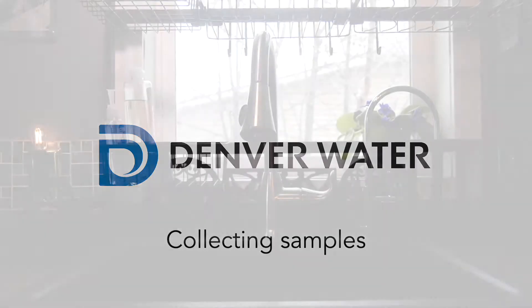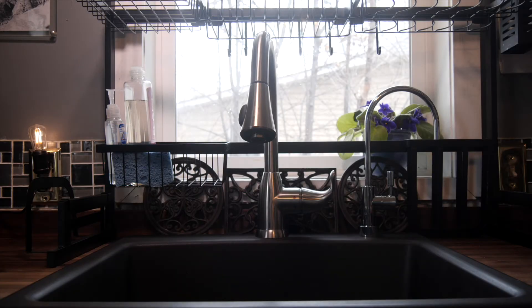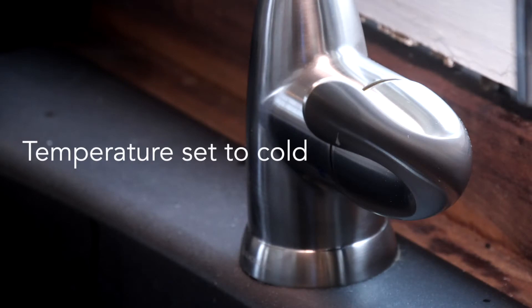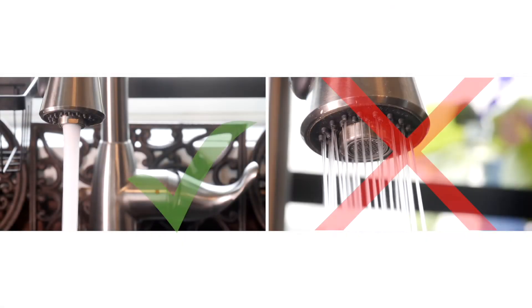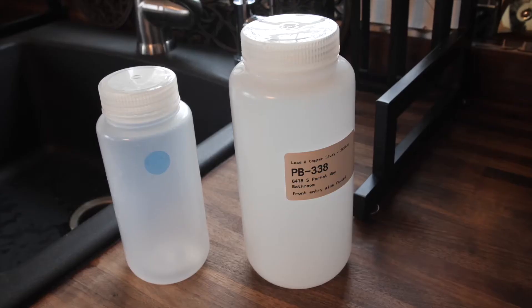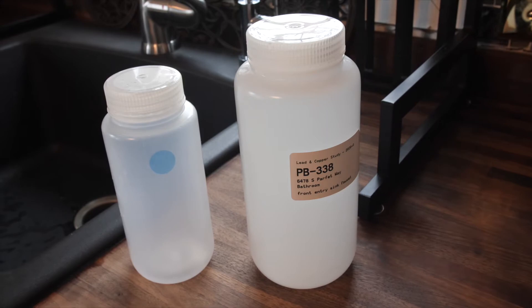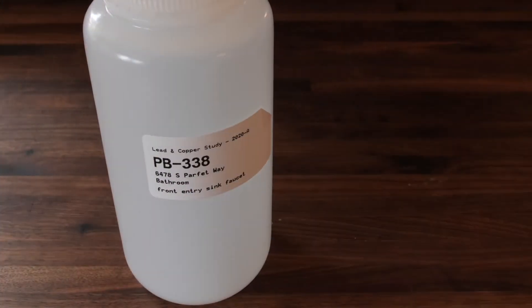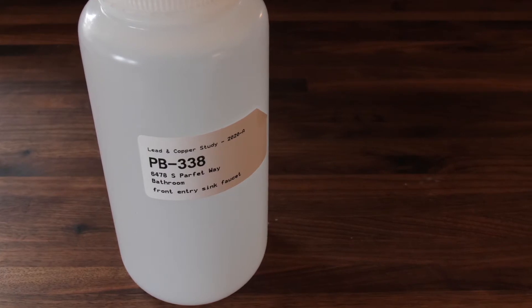After the stagnation period, it's time to prepare for your water sample. It's important that you do not turn the water on while you're setting up. Also, if you have a faucet with a single handle, make sure the temperature is set all the way cold and check to make sure the stream is set for straight and not the shower style. Next, set the large and small bottles next to the sink and remove the lids. The larger bottle is the first draw bottle.